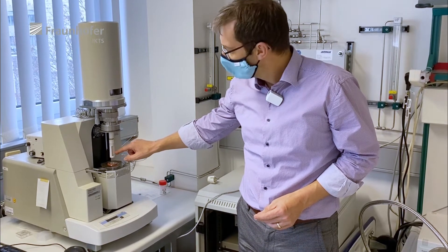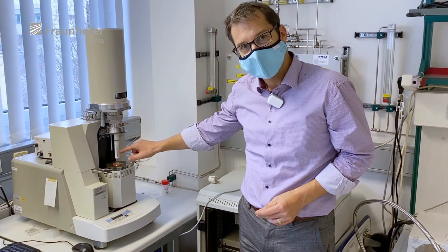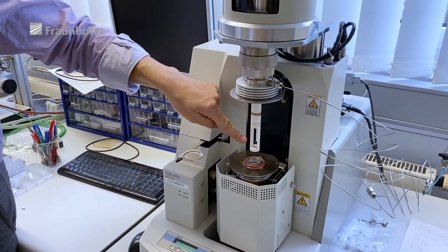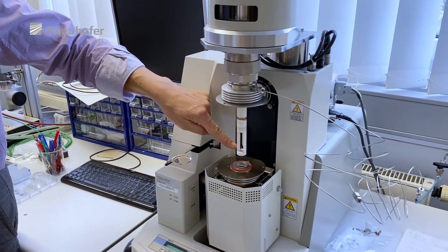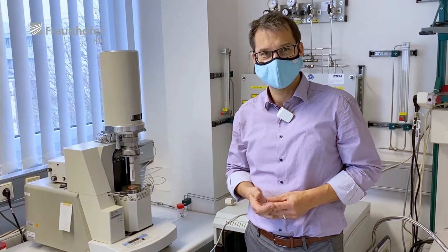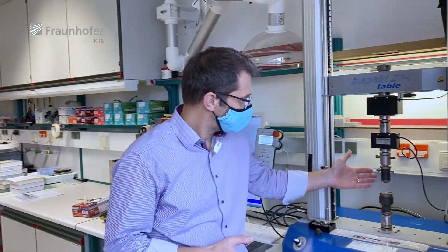Here we see a vertical dilatometer which we use to measure the viscosity of glass powder compacts by the principle of parallel plate viscosimetry. Powder compacts are placed between the plates and a plunger presses on the top of the compact. As the compact is heated continuously, the plunger descends at a speed according to the viscosity of the glass, and from the resulting data we can extract discrete viscosity values very precisely in the temperature range of interest. After sintering, we also measure the strength of the powder compacts by the ball-on-three-ball method according to Professor Danzer.